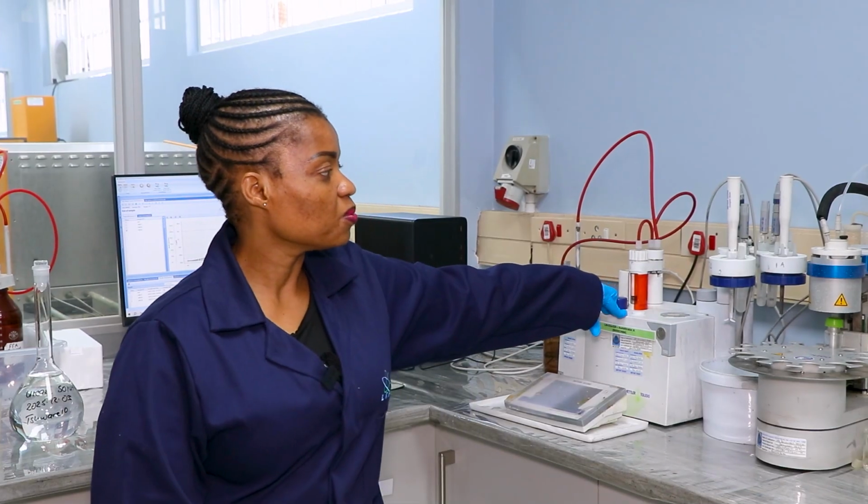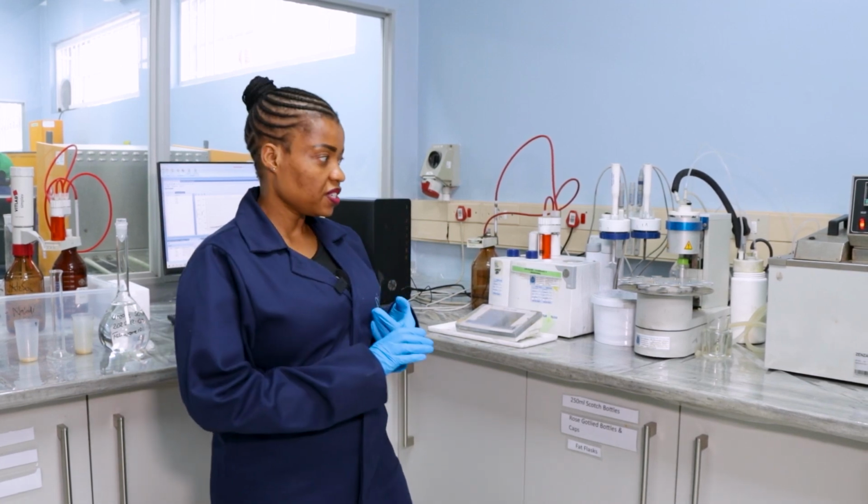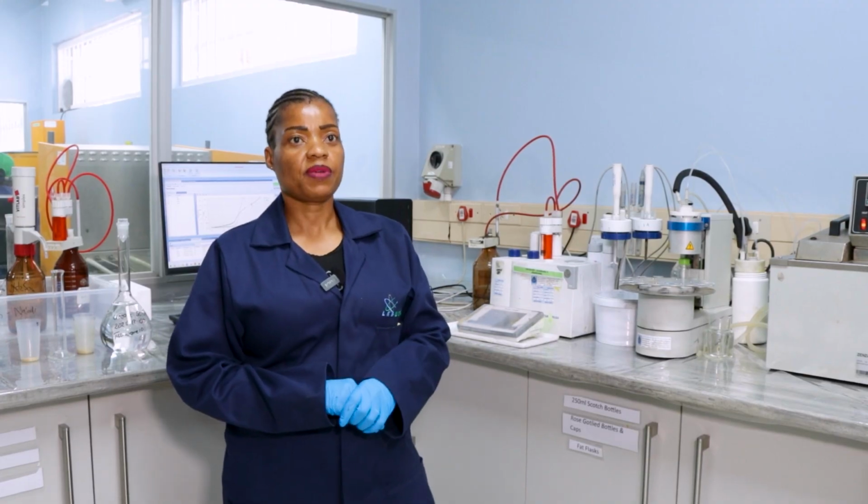I'm responsible for analysis that we do on the auto titrator. This is the auto titrator that I work on. We do analysis like free fatty acid, urease, chloride, Karl Fischer. This is the analysis that we do depending on the requirements of the sample that we have.